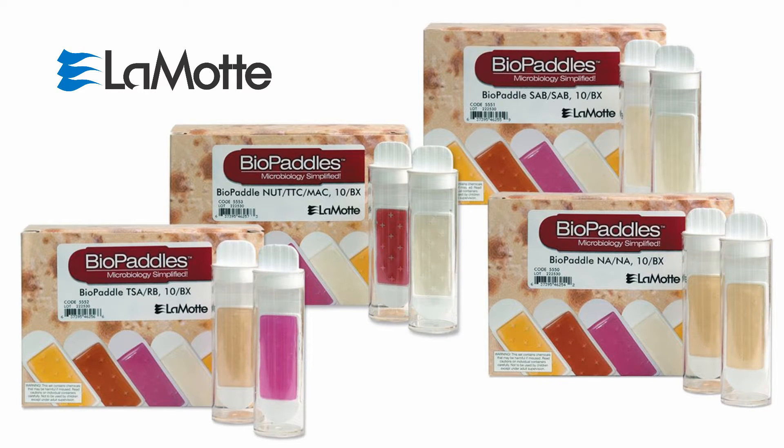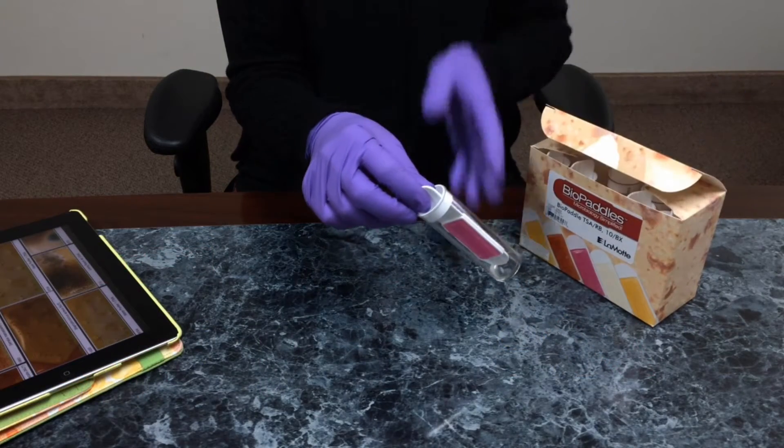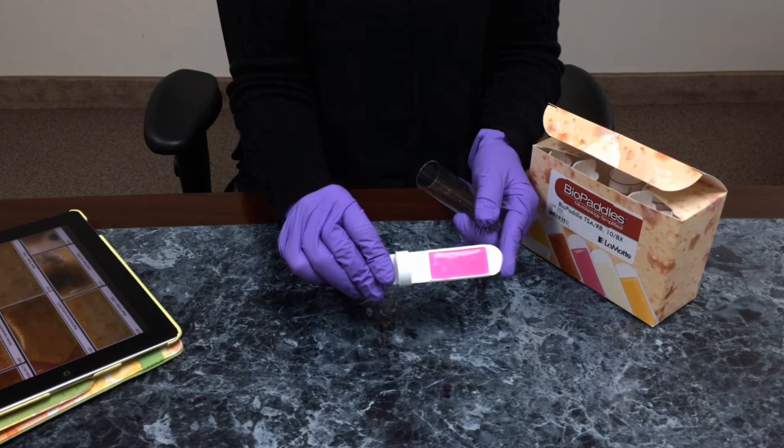Bio paddles are flexible paddles with a microbe-specific media on each side, enclosed in a sterile vial. They are ready to use out of the box and do not require prep. Bio paddles may be stored at room temperature and have a longer shelf life than traditional petri dishes.